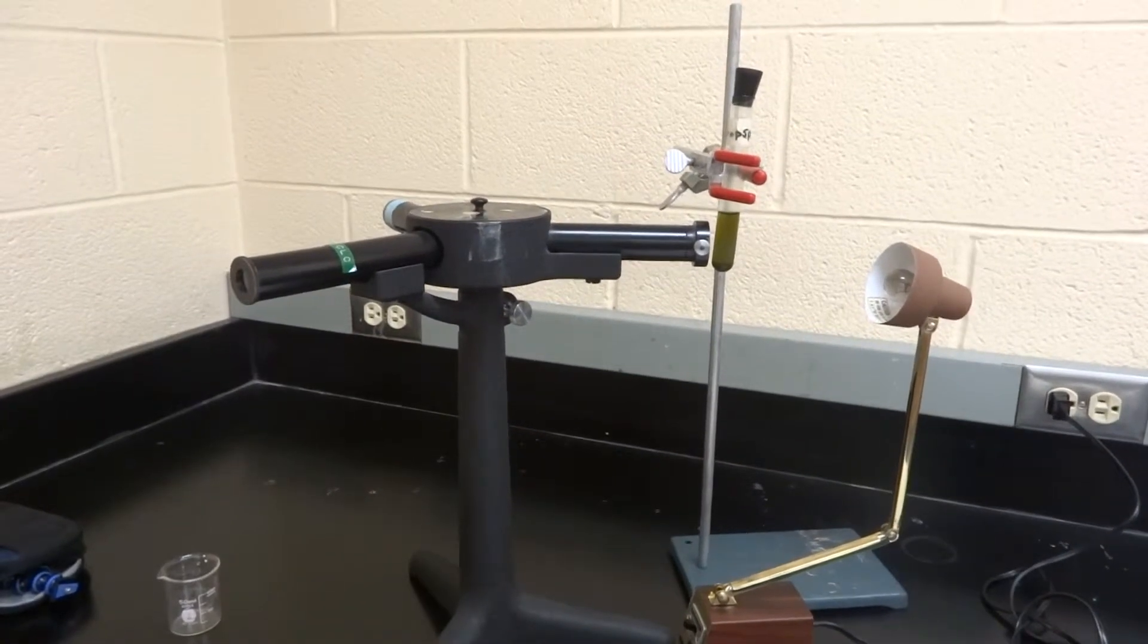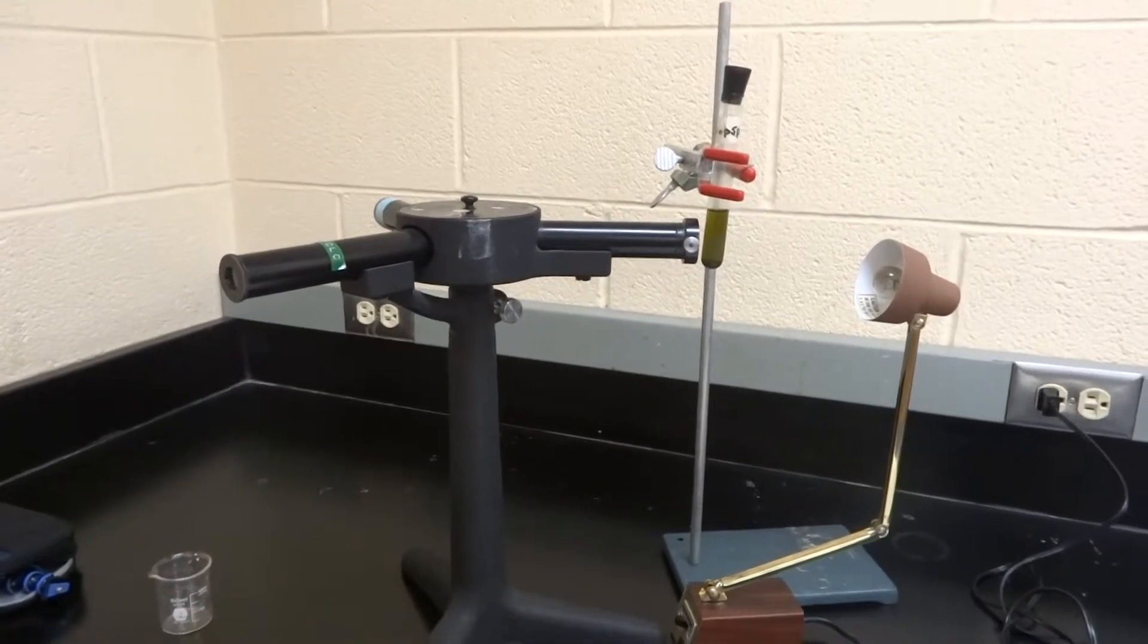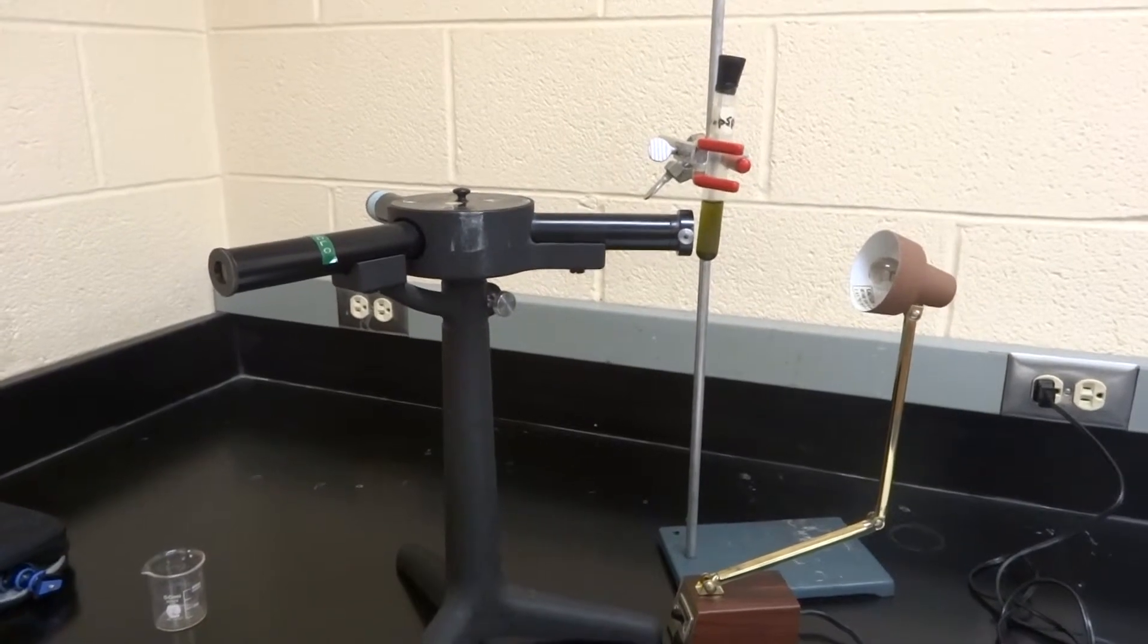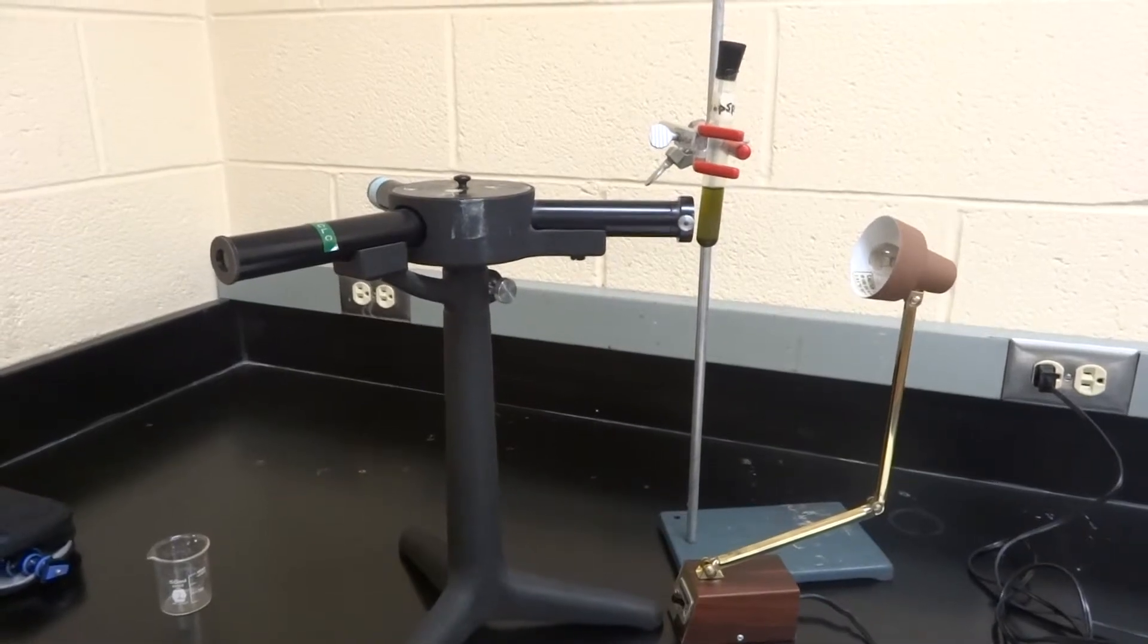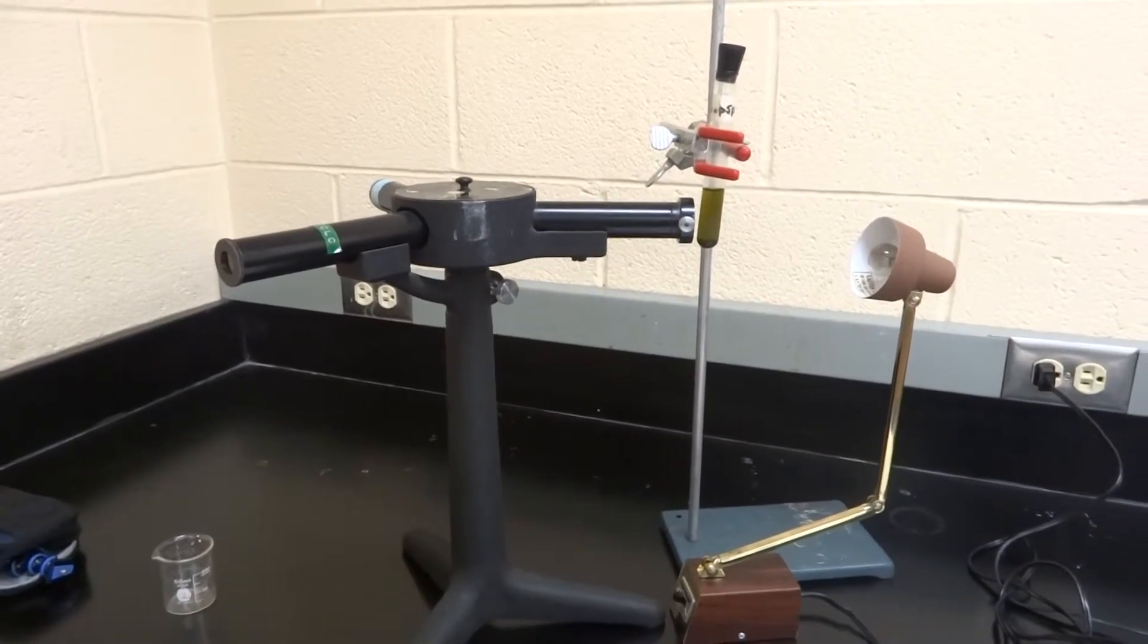So I have in front of me the last of the procedures for photosynthesis. This is procedure 8.5 where you're going to be using a spectroscope to look at how the plants are going to be using light.